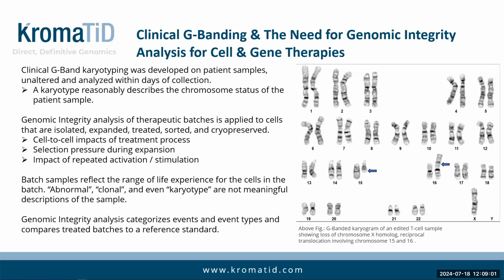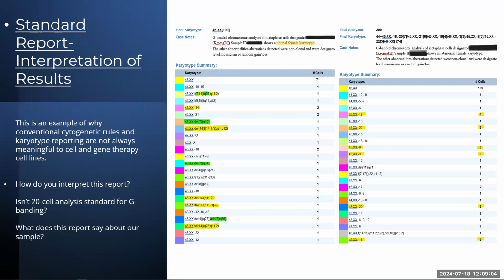This next slide, we're going to go into more depth of why we decided to transition to an easier report for our customers to interpret. These are some of the questions that they typically had for us. And we're going to go look at the report on the left. Getting into higher cell counts, the pros are you're getting a more in-depth analysis. Detection limits are higher.